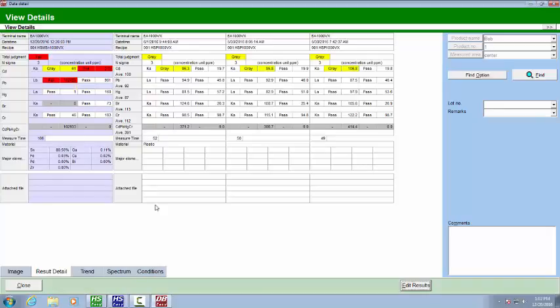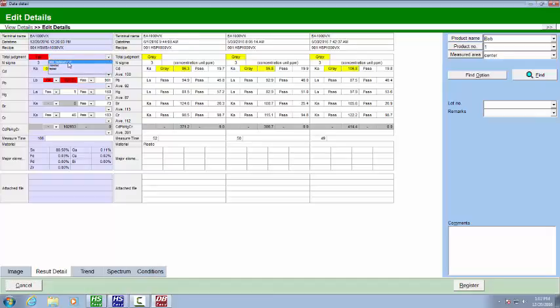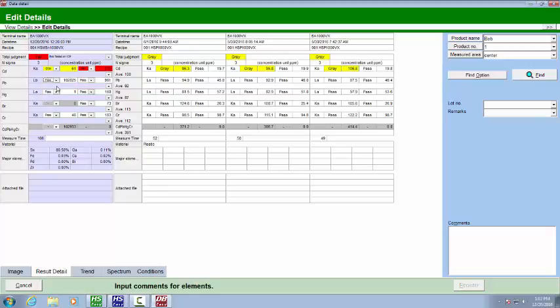Now let's see a more detailed report. But before I do that, let's do one other thing. I just noticed we can hit edit results. And up here you can say this part failed. Total judgment. We can edit this. Let's say I tested it on an ICP and I'm going to say it passed. So I come down here and select this. It's passed.